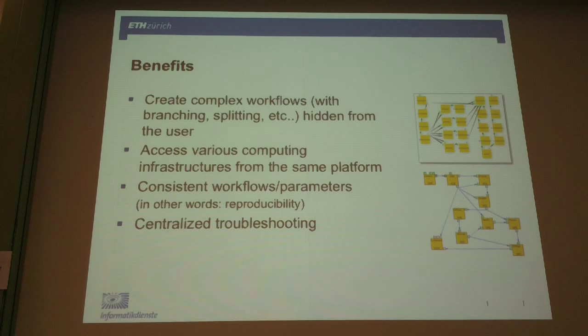With this gateway technology, actually the one that we use at least, you can access various computing infrastructures. So if you have number crunching jobs, you can submit them to a cluster. If you have license-bound jobs, you can submit them to a dedicated machine. So this is all easily possible for the gateway administrator. You can create consistent workflows, so you do it as a gateway admin. It's standardized, it's harmonized, and not everybody is doing their own thing.